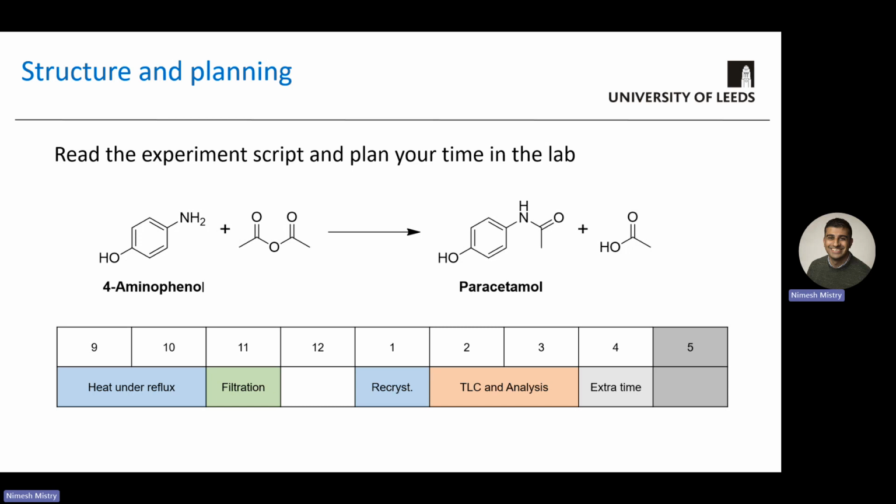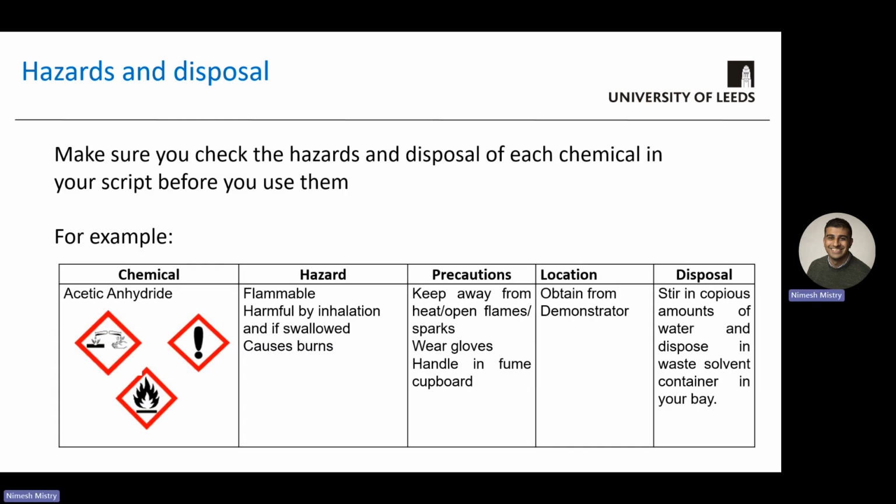And then in the afternoon session, you can work on further purifying your paracetamol by recrystallization in water, and then when you filter and dry the paracetamol, you should have some pure paracetamol, which you will then analyze using TLC and further techniques like infrared and melting point. You should be able to do this comfortably within a few hours, but there is some extra time banked in there as well should you need it.